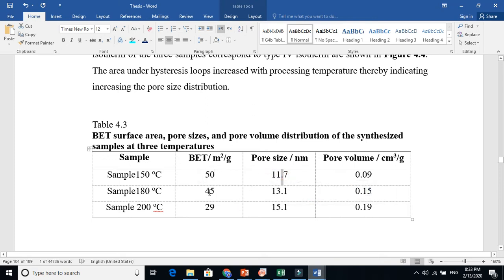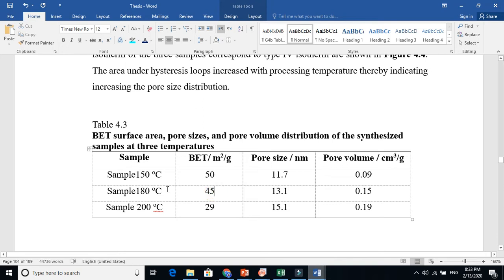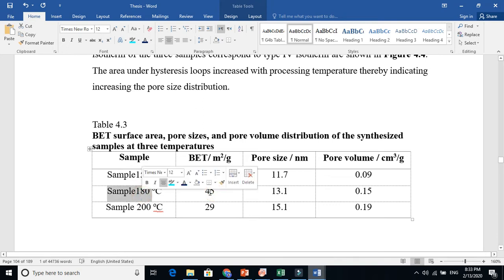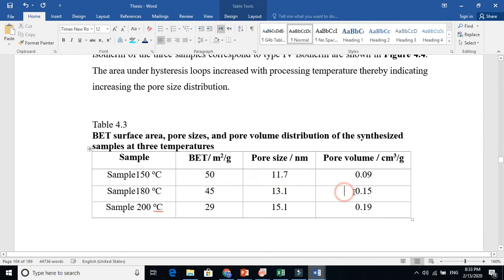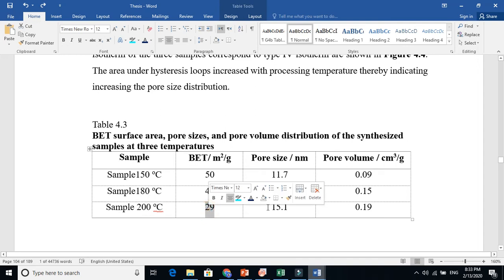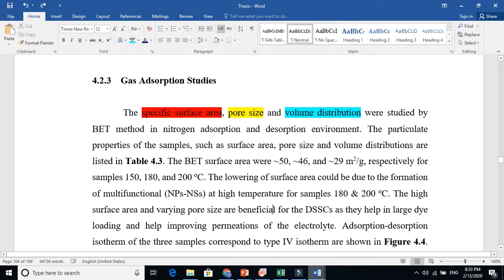The first sample has larger surface area because the pore size is smaller. For the 180°C sample, the specific surface area is 45 square meter per gram — one gram covers 45 square meters. Here, the pore size is increasing and the volume is also increasing. For the 200°C sample, increasing temperature decreases the specific surface area and increases the pore size.